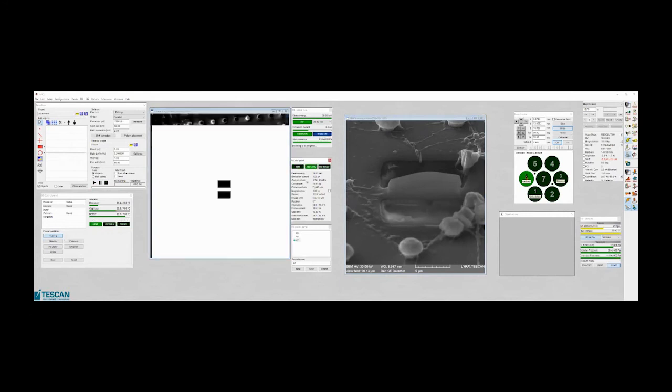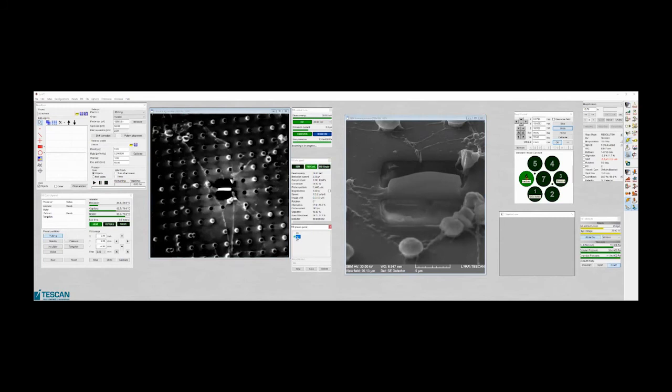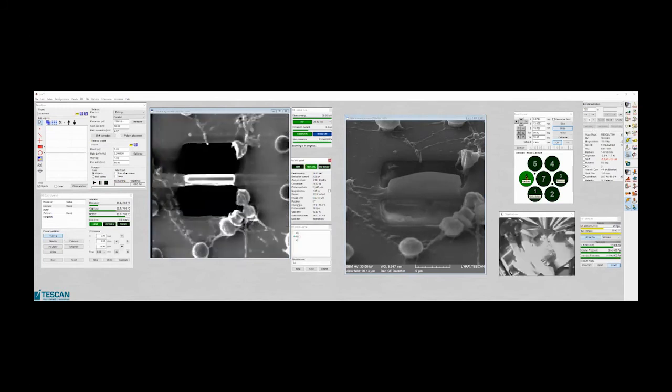I will put now the one which is not so huge. It's worse.